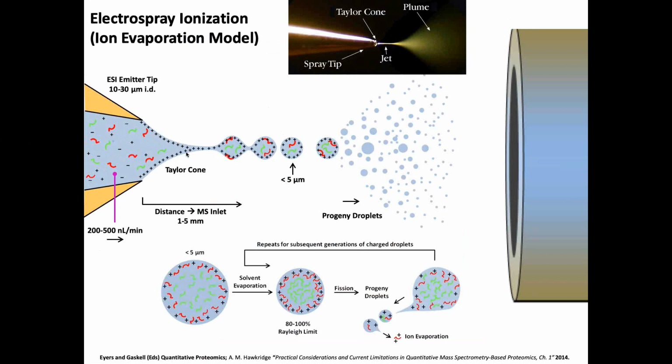And as that flow continues to move the salt solution through the electrospray emitter, you end up generating these parent droplets. These parent droplets include the analyte, certainly the solvent that you're electrospraying in, and then this charge excess that surrounds the surface of the droplet. Right? These charges have no interest in being near each other; they want to get away from each other. So the first thing that's generated is this charged liquid droplet with your analyte in it.